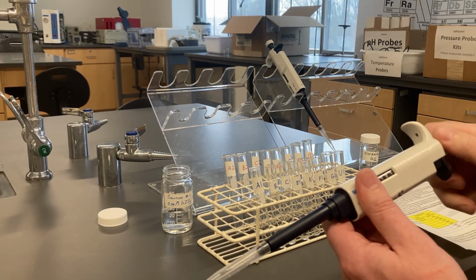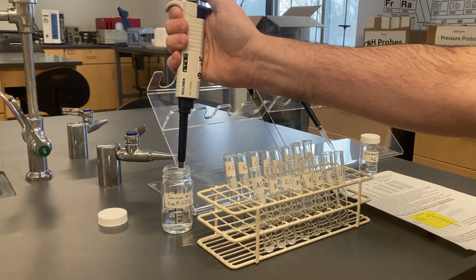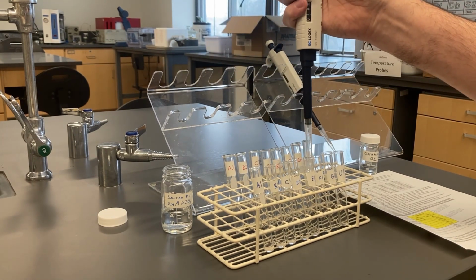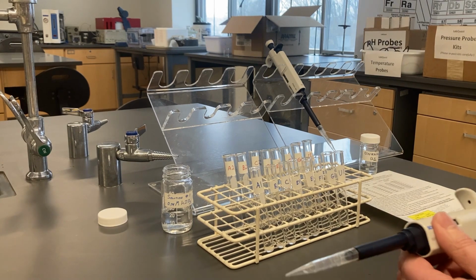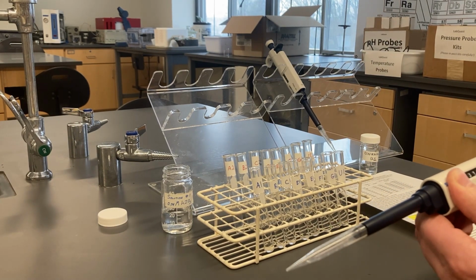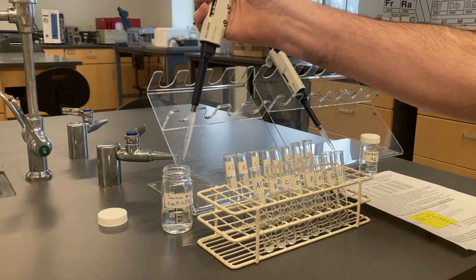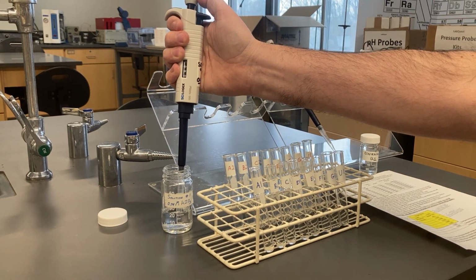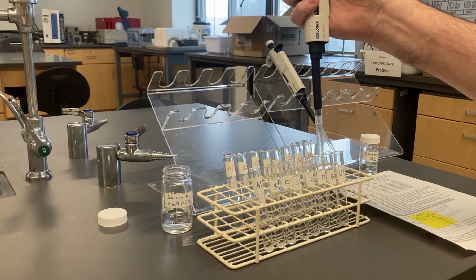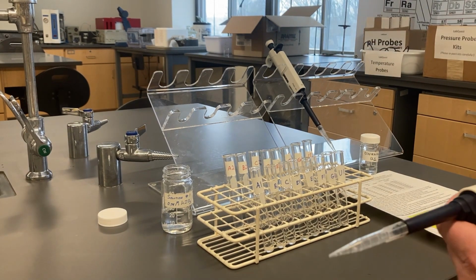And E1 gets 100. F1 gets 400. And G1 gets 100.